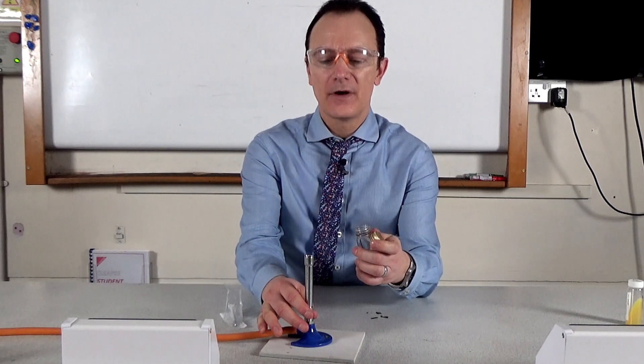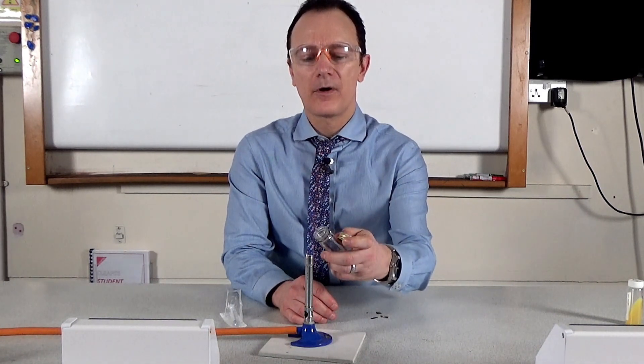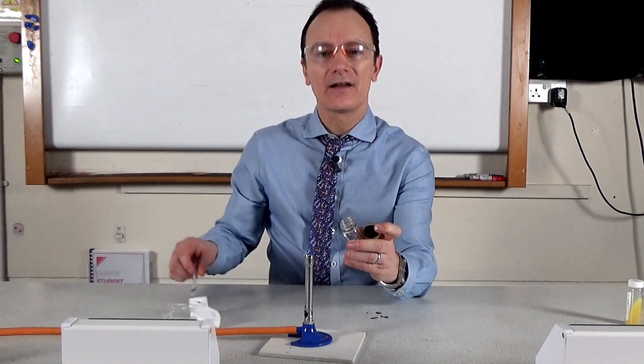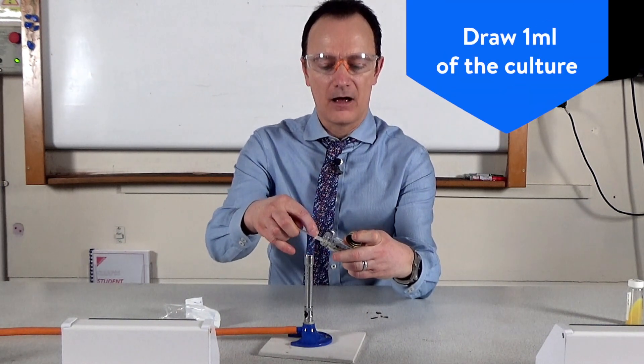We then turn the Bunsen burner to the blue flame and flame the neck of the bottle, making sure we're twisting it. Then using the sterile syringe, we draw up one milliliter of the culture.